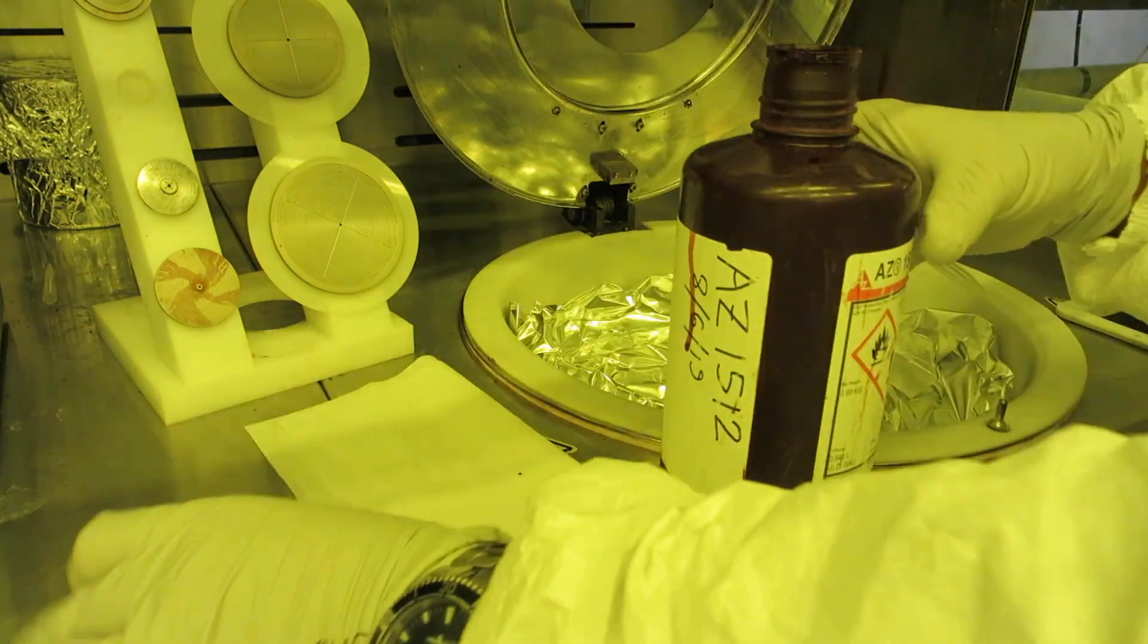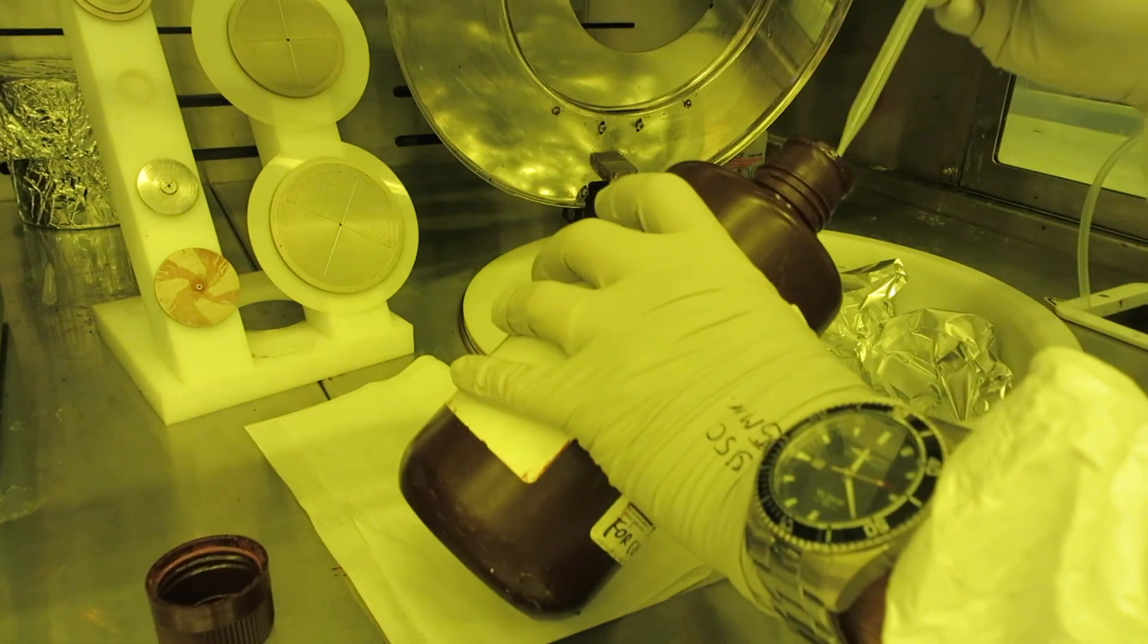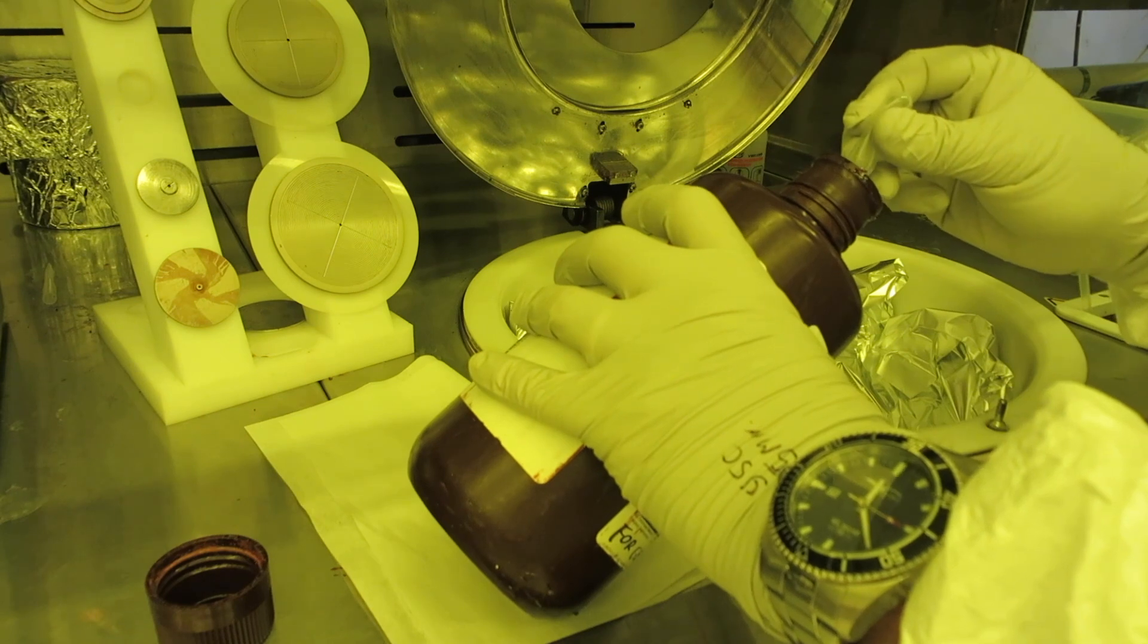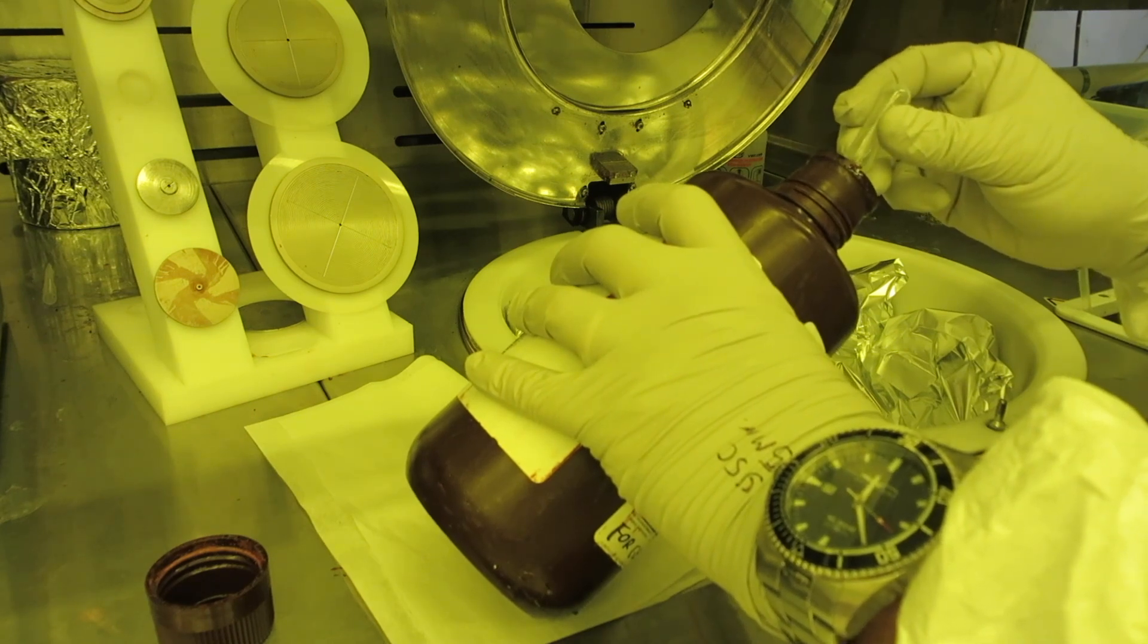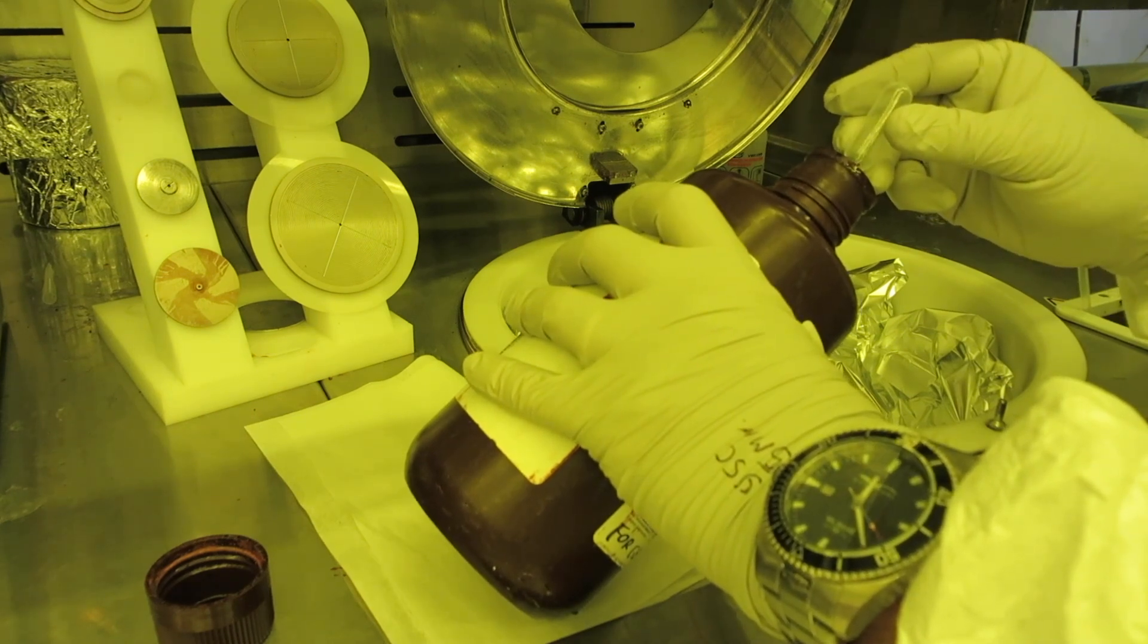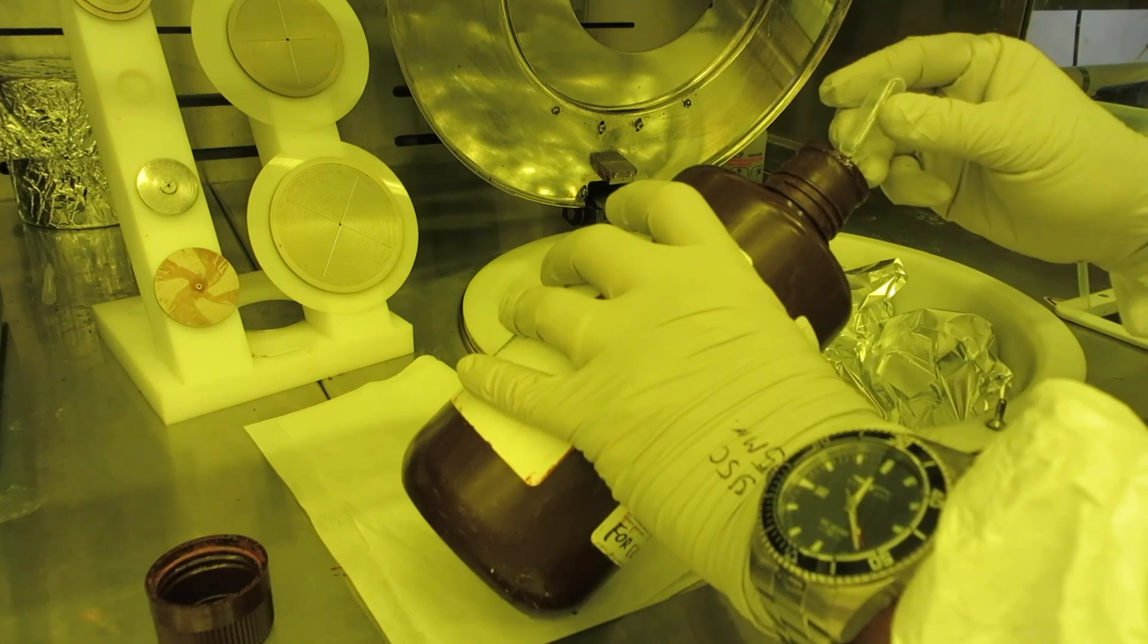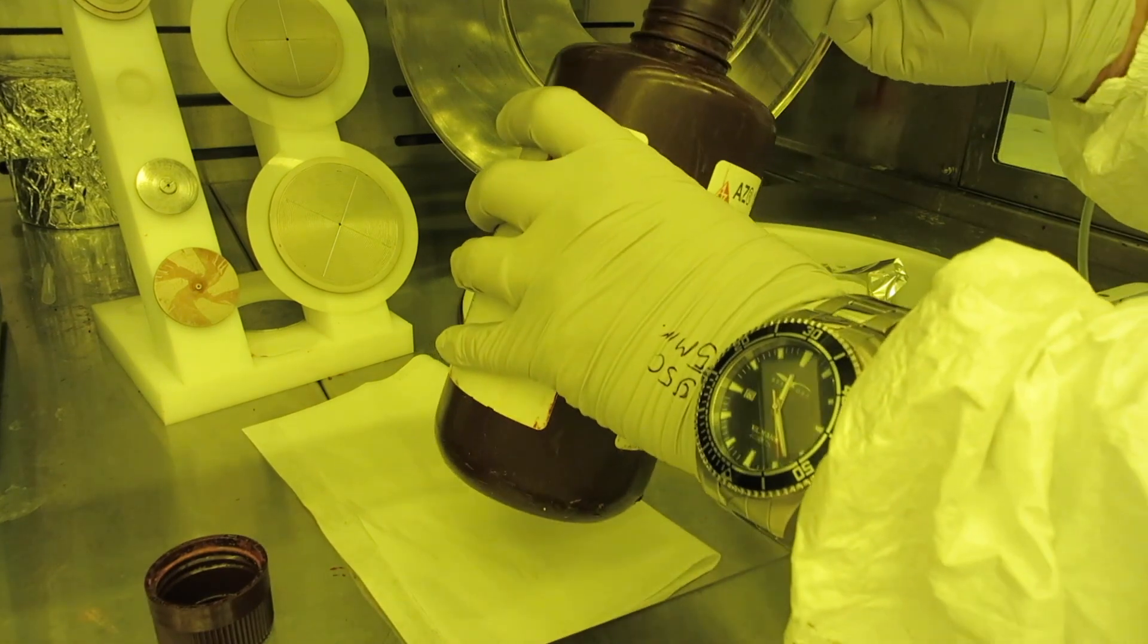Now you're ready to start dispensing some resist onto the chip. Open the bottle and tilt the bottle. Squeeze the pipette and stick it into the resist and allow the resist to slowly flow up into the pipette. That will help you to keep from getting bubbles in the resist.